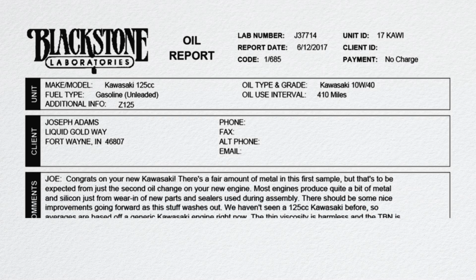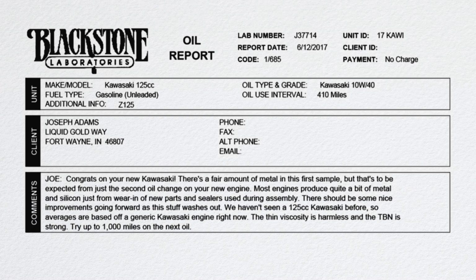Now, the comment box. If there's one aspect of our report that sets us apart from everyone else in the rest of the industry, the one aspect that keeps people coming back, the comment. Now, this is not only where we're going to describe problems or the lack thereof, it's where we're going to try and do so in layman's terms.